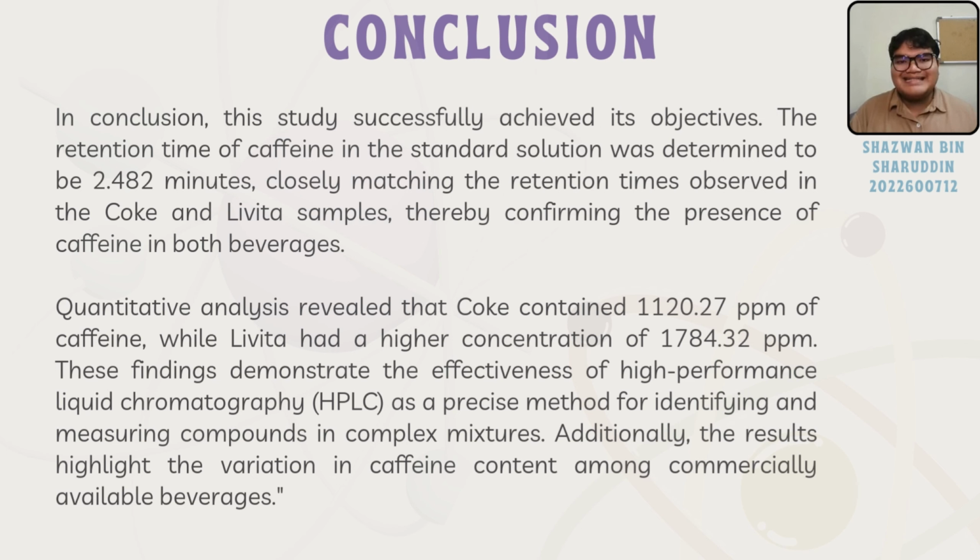Quantitative analysis revealed that Coke contained 1,120.27 ppm of caffeine, while Levita had a higher concentration of 1,784.32 ppm. This finding demonstrates the effectiveness of high-performance liquid chromatography, well known as HPLC, as a precise method for identifying and measuring compounds in complex mixtures.